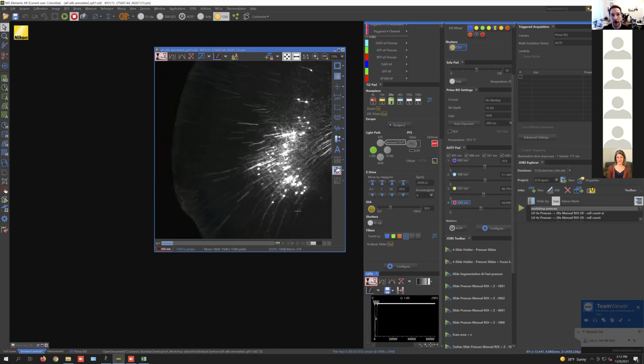The way you would go about capturing data for a pipeline like this is, use the settings that you would be using for the acquisition of your experiment. So don't capture data with a different objective and then train it and then try and use it with the objective that you've decided on later on. Figure out exactly how you want to run your experiment, if it's going to be with the 10x or the 20x, and with binning or not. Figure all that out first.